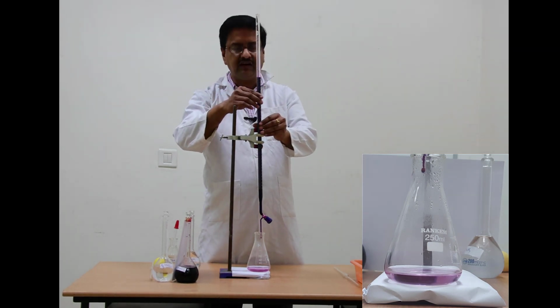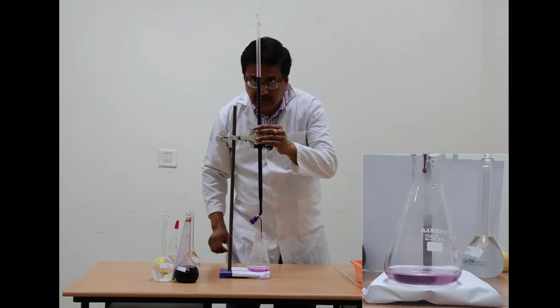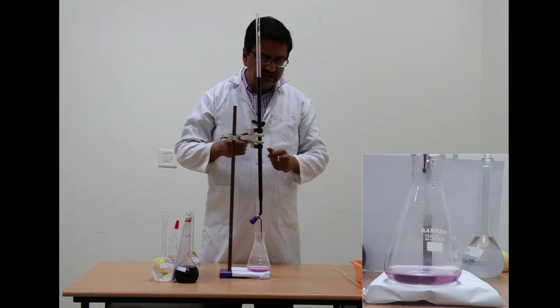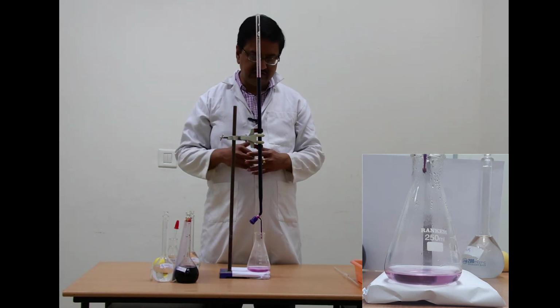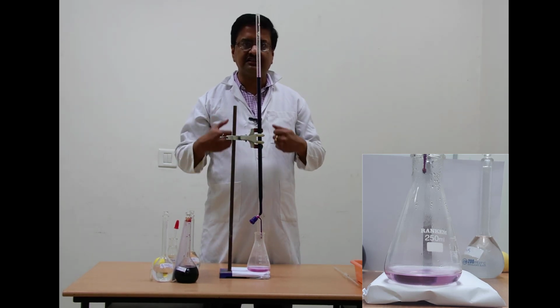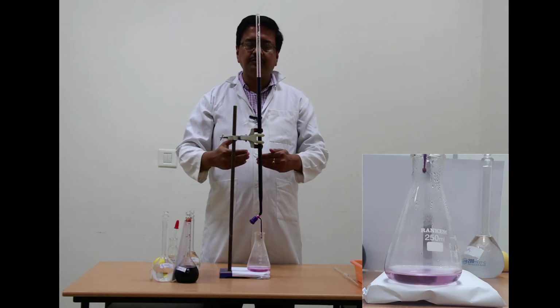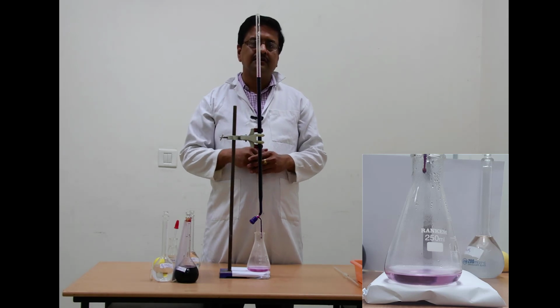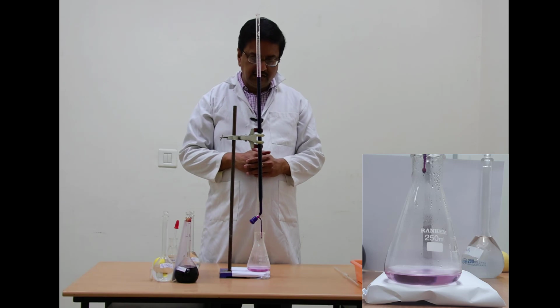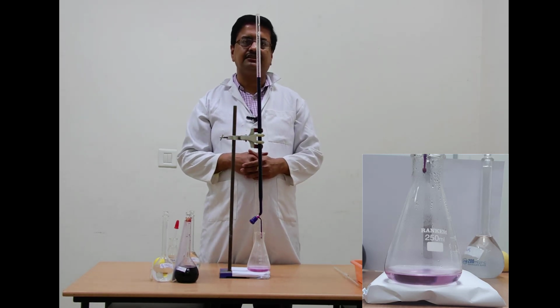So now let me see what the burette reading is at this point. This burette reading is exactly 12 ml. So we will use this burette reading for our calculation. Now what we need is to reproduce this experiment at least 3 times to get concurrent burette readings. So I will again pipette out a fresh solution of oxalic acid and sulfuric acid in a new conical flask, heat it, and then show you the titration once again.